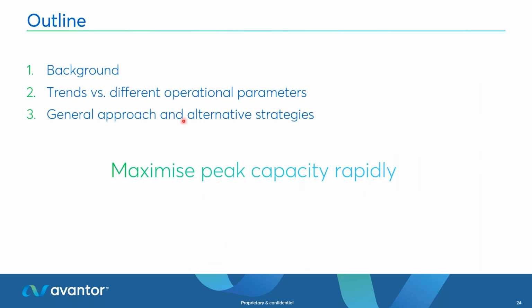And with that, I wish you all the best of luck. Now you have a lot more insight into gradient elution theory for reverse phase conditions, and the stories behind those papers that really comprehensively and elegantly have a boiled down protocol to maximizing the peak capacity for peptides and small molecules. When you come across a new, complex sample, please use this information and use those practical guides to maximize the peak capacity in a rapid fashion.